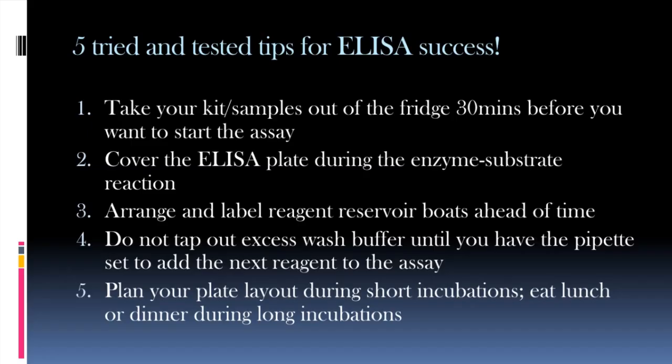And this usually comes up for me where I'm adding a reagent that has a different volume. After I finished tapping out my wash buffer, I realized that, oh, I need to change the setting on my pipette, for example. So it's good to set all those things up before you do that final tap out of your wash buffer from your plate.